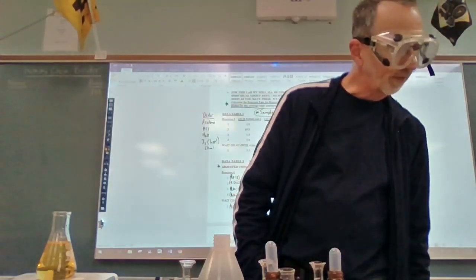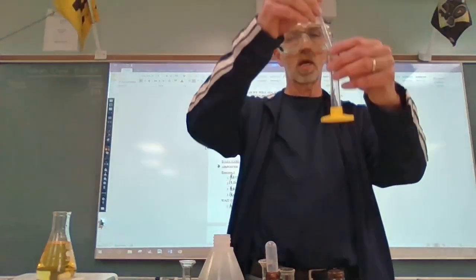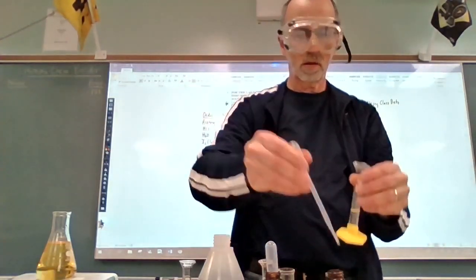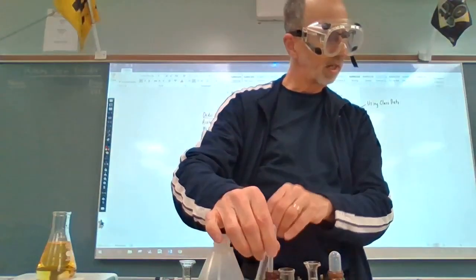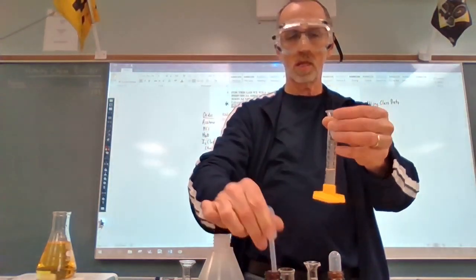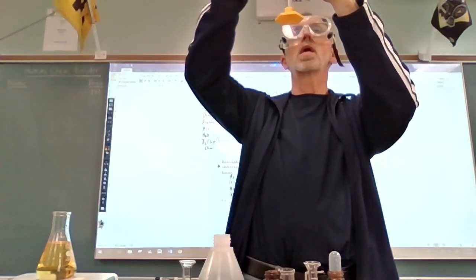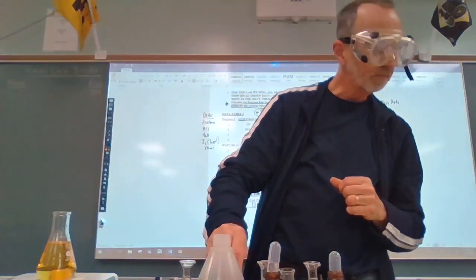All right, so reaction 4, I need 5 mLs of acetone. 10 mLs this time of HCl again. Water, 5.